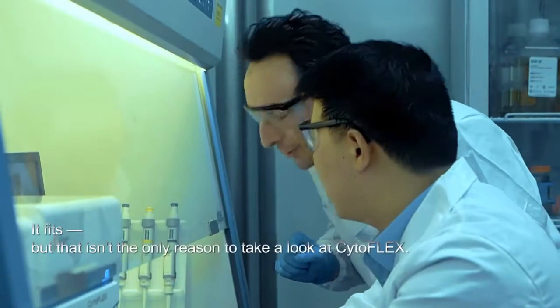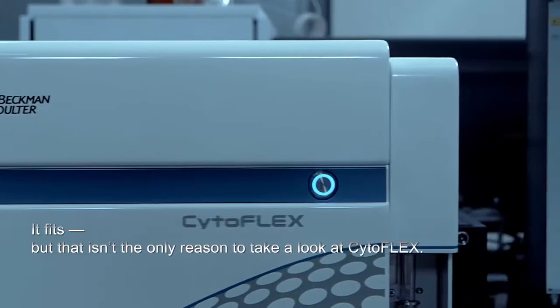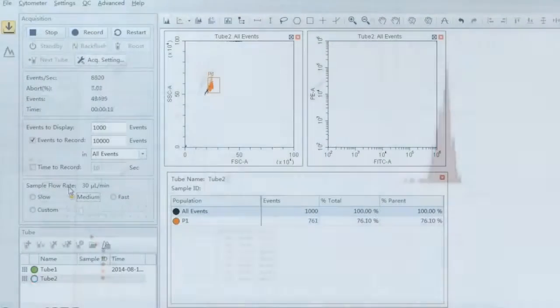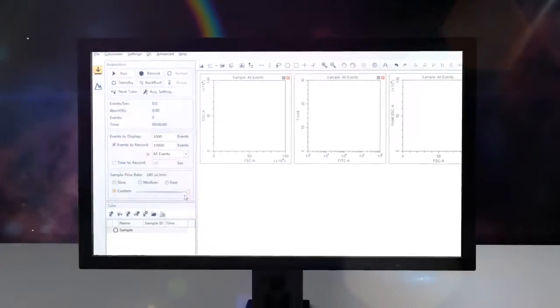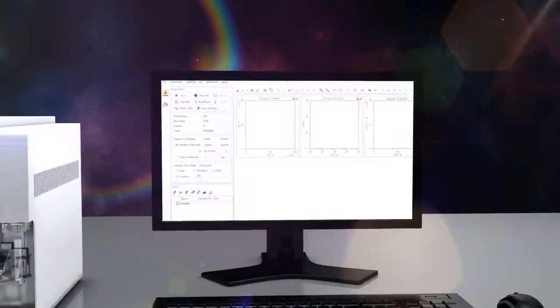Its compact footprint isn't the only reason to take a look at CytoFLEX. With its innovative hardware and highly intuitive CytExpert software, CytoFLEX delivers powerful performance with exceptional sensitivity, similar to or better than market leading cytometers four times its size.